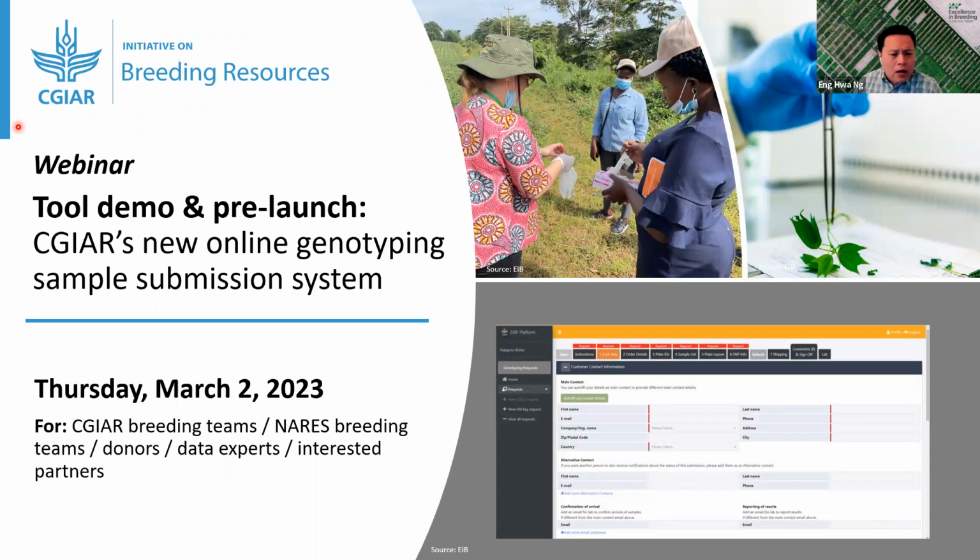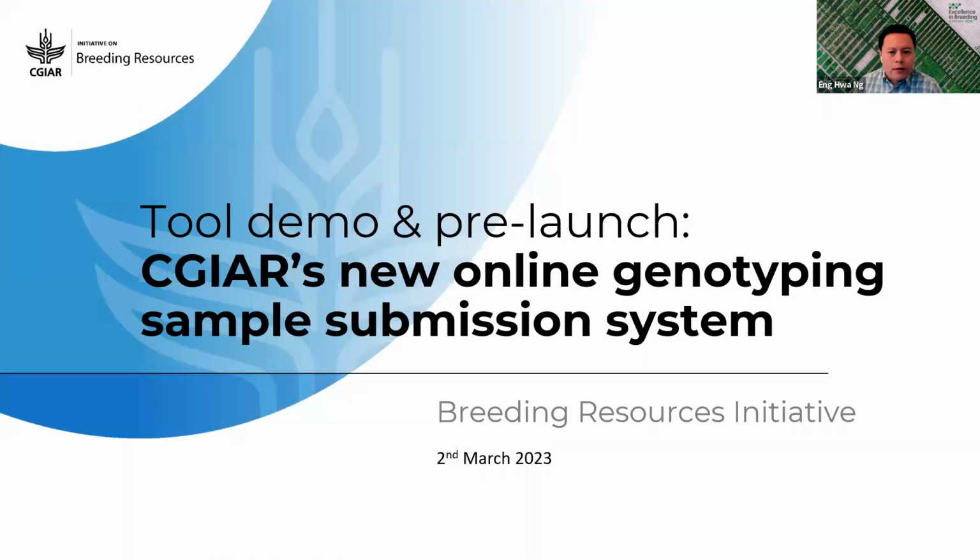for this event. In terms of the flow of the webinar, I will kickstart the webinar by giving everybody a quick update on the scope and expectations of this tool, and then I'll hand over to Nick for a demo on how to submit a job through the sample submission tool. Without further ado, I will switch over to my next slide. All right, this is a cover slide.